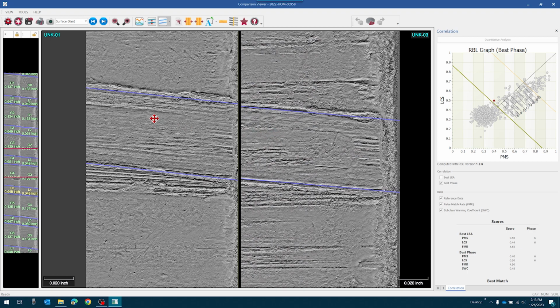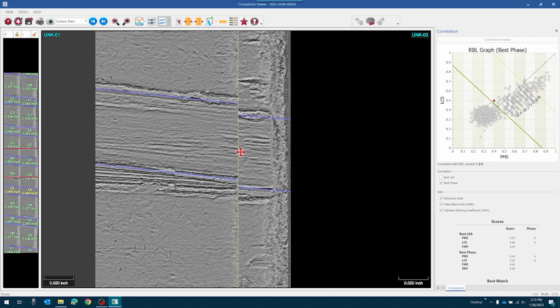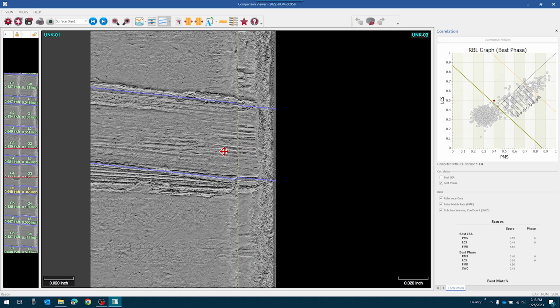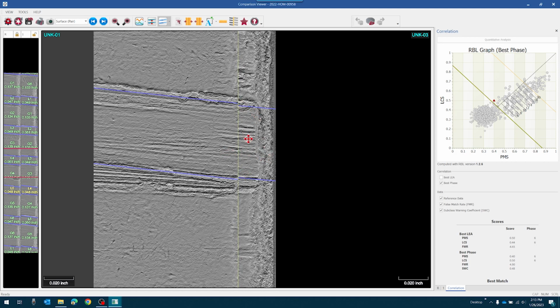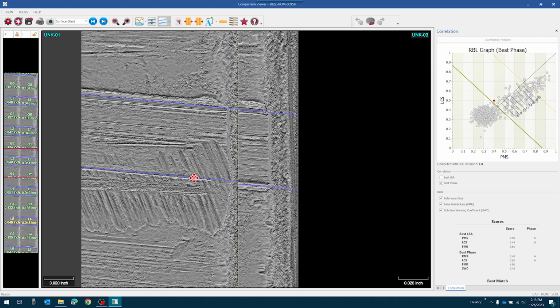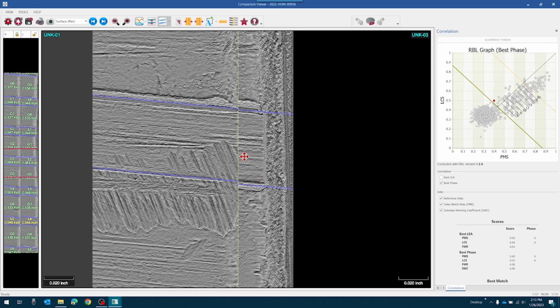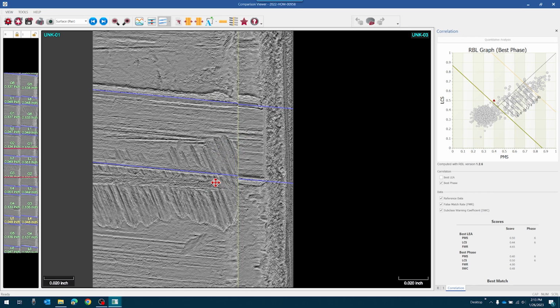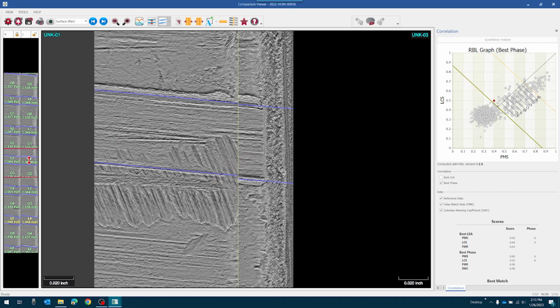surfaces. And even when you look for some features that happen in other areas, they happen on one but not on the other. That means that while there's agreement to be seen, which we are honing in on, at the same time they are not comparing as strong as some of the other ones have. There it is right there. Once you get those shoulders lined up more or less, that should bring it up to light. So that's why this one has some agreement to work with, but it's not scoring as strong as some of the other comparisons. This one was just getting good when all of a sudden some contact, probably with the water tank here, has ruined what could have been a pretty strong comparison.